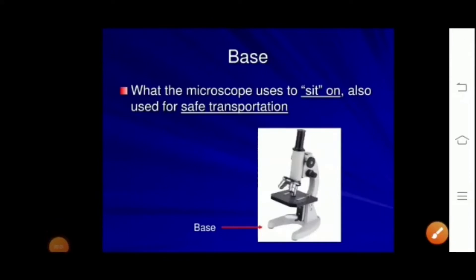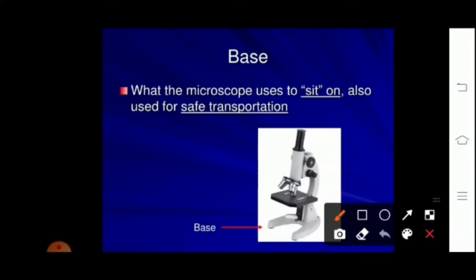We are going to understand the mechanical parts. This is the foot of the microscope, also called the base — what the microscope sits on. It is also used for safe transportation.